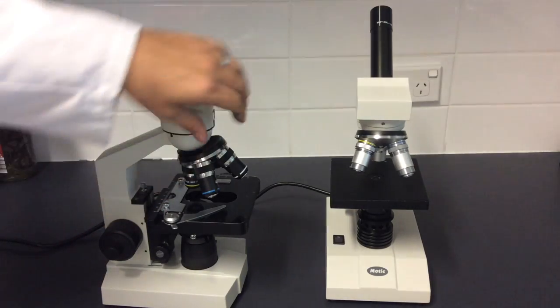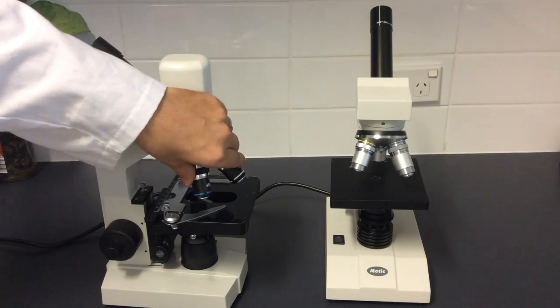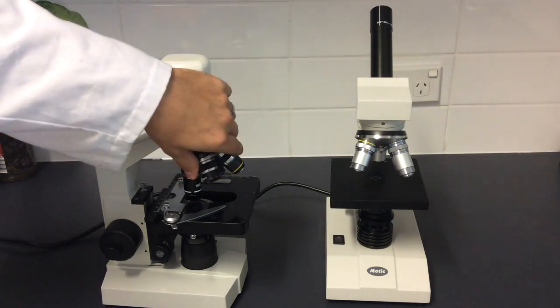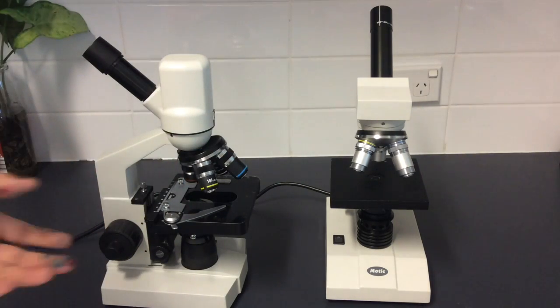So you've got three and then there is the revolving nose piece here. Okay, so they revolve around like that. Make sure you revolve around from the top, not holding actual objective lenses.